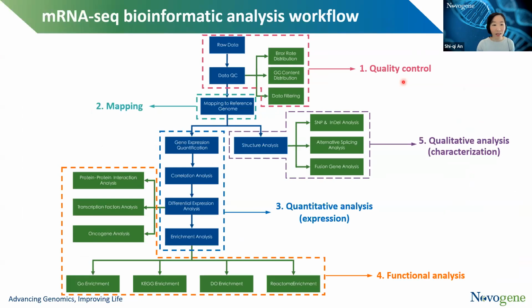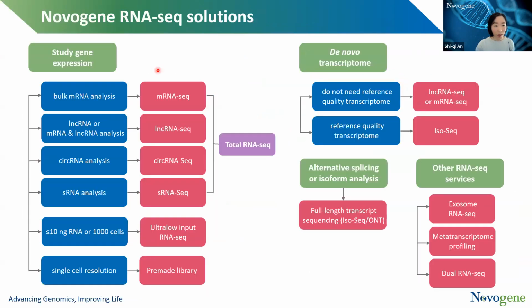And then the requirement for the library, the quality of the RNA, usually is quite high. The amount you need to start with is quite high. So FFPE samples, in some cases, may not reach those criteria at the starting point.